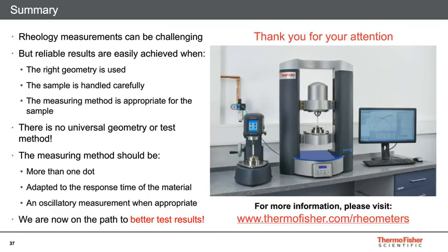So that leads us to the end of today's webinar. You kind of know going into today that rheology measurements can be challenging, right? Especially for the novice user, but reliable results can be achieved when we take the right precautions, right? We're selecting the right geometry for our material and for the measurement procedure. Sample is handled very carefully. If it's fragile, we're scooping it. We're being very gentle when we lower the head. We're trimming it carefully. And then we select the right measuring method for our material.